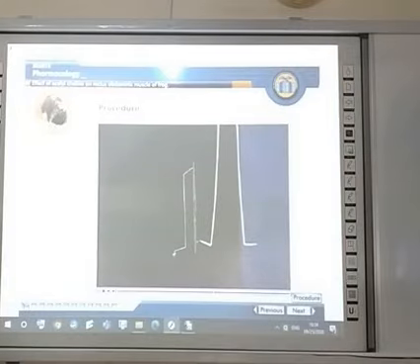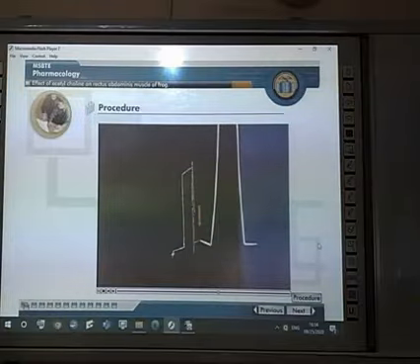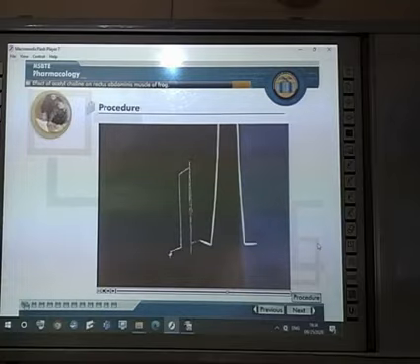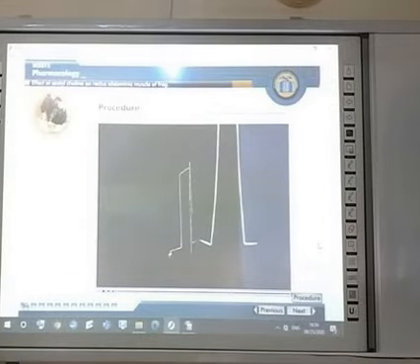Because of this, the writing tip of the lever slowly reaches towards baseline. Repeat the procedure using 0.2, 0.3 and 0.4 ml of acetylcholine solution.